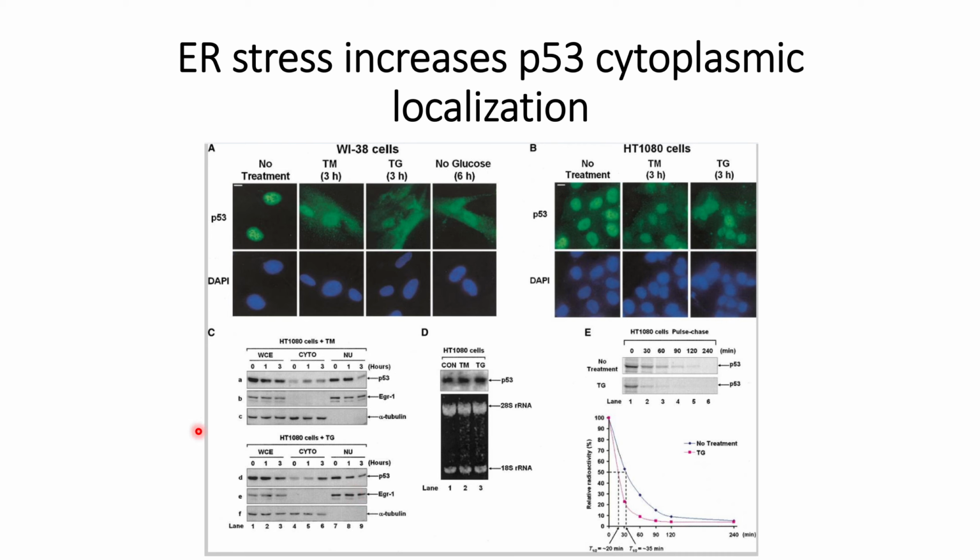In order to confirm the quality of this subcellular fractionation, they did a check. They used two different antibodies, such as EGR1, which is mainly present in the nuclear fraction, and alpha tubulin, which is mainly present in the cytoplasm. So the subcellular fractionation quality is also good in this experiment.